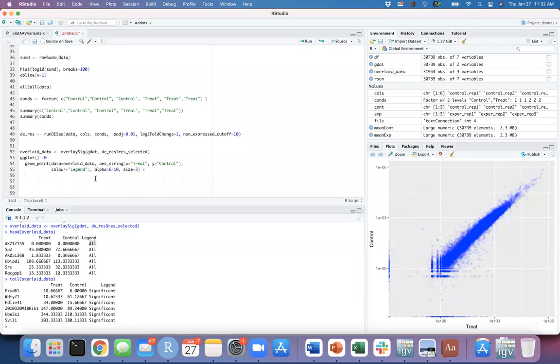By the way, if you add more names into this, for example, upregulated or downregulated, or some gene set that you want to look at, a gene of interest, you can change the legends for those genes. How are you going to do it? Basically, you do a subset like I did. This was my overlaid data. You can change the legend, for example, for FGF21.